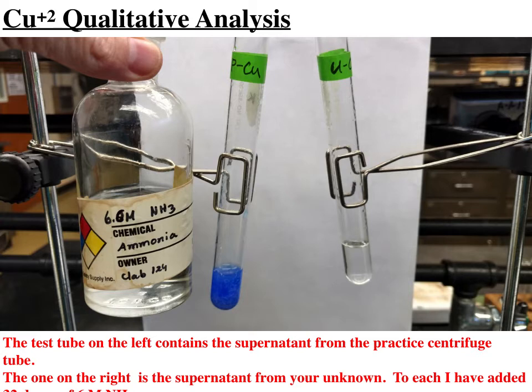Remember that the practice tube definitely had copper cations present; the unknown tube is what we're supposed to be determining. So I added the 6 molar NH3 into both of them, and this is how the color of those supernatants appear after that addition. From this information, you are to determine if your unknown sample contained copper cations.